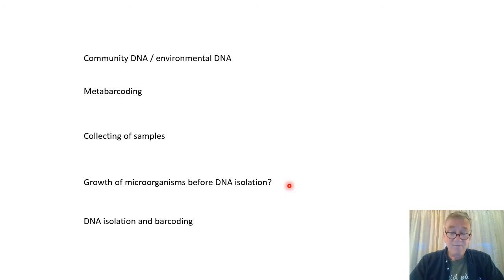Of course, a risky thing with that is that some microorganisms will grow happily on a bacteria media plate or in some liquid media, but other bacteria or other organisms are very difficult to grow in the laboratory. So we run the risk that some species will not amplify or not grow in this media.